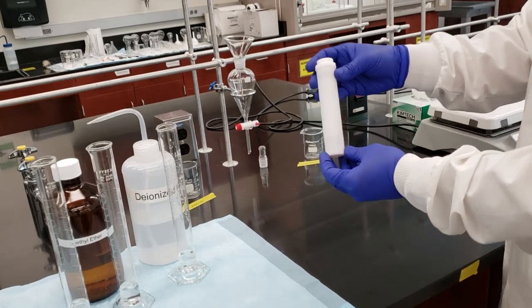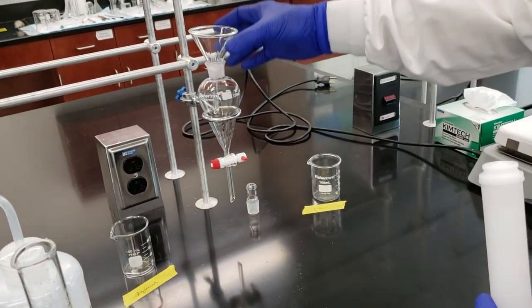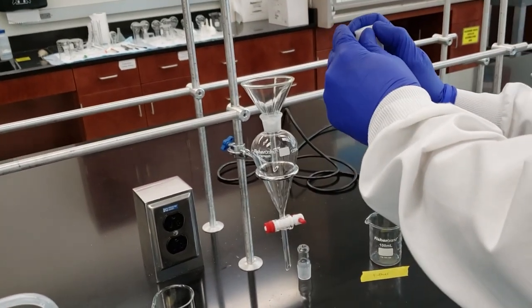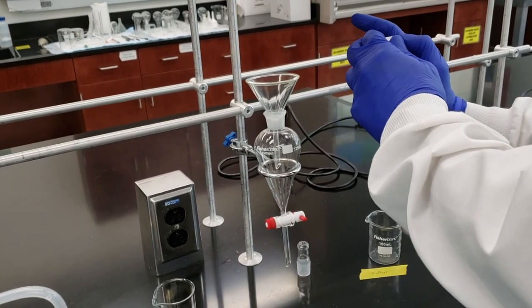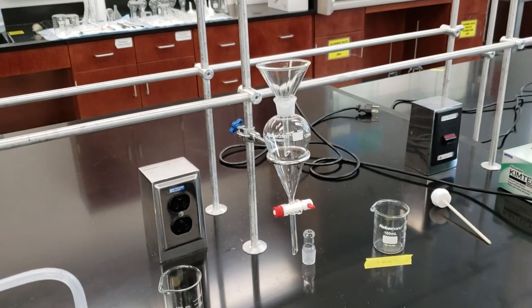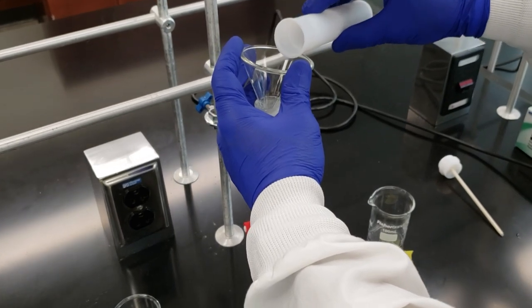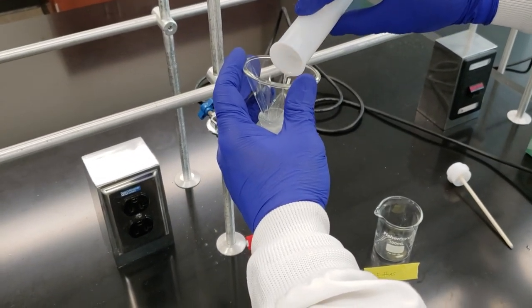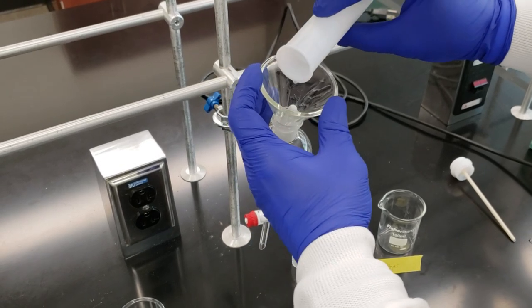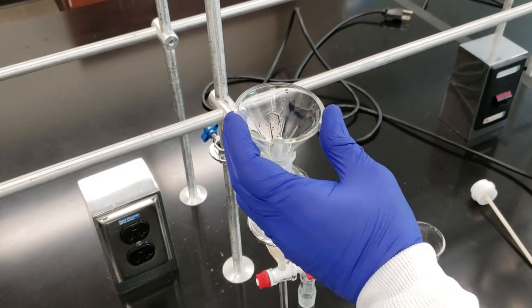All right, so we have our reaction vessel, our Teflon vessel here, brought back to the benchtop. We've set up our separatory funnel. I've put a short stem funnel on the top, because I'm going to open up my Teflon reaction vessel. I'm going to set aside my thermal well here, and pour the contents of my vessel into my sep funnel. I'm using my short stem funnel as a way to capture my stirring bar. All right, so that's captured in the top there.